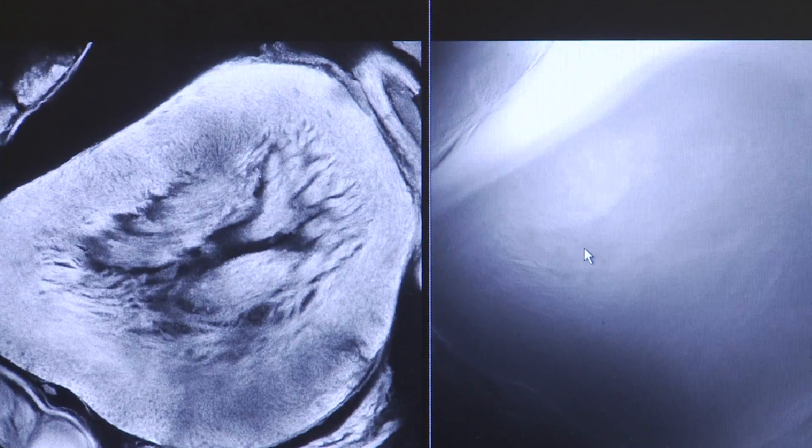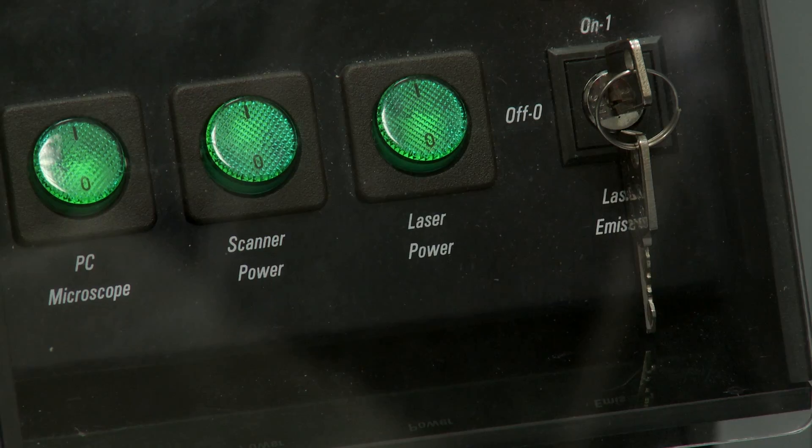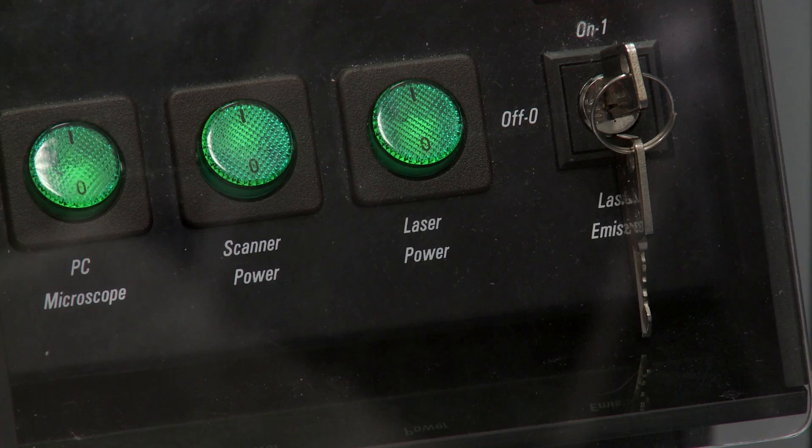Instead of using a white light source, like a light bulb, to illuminate your sample, you're using lasers of various colours to illuminate your sample.